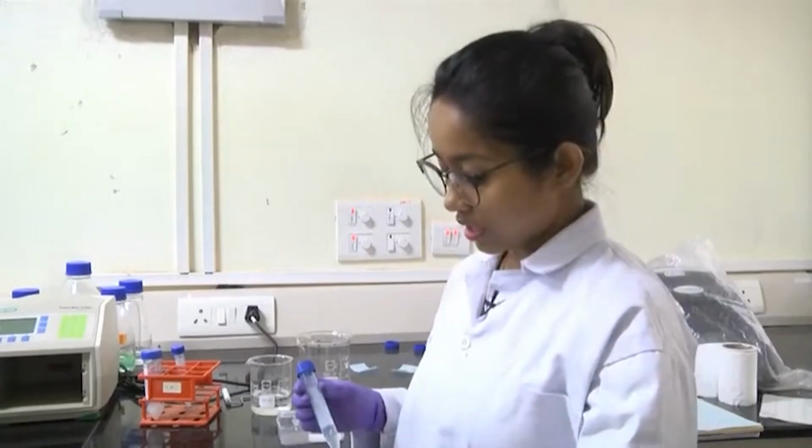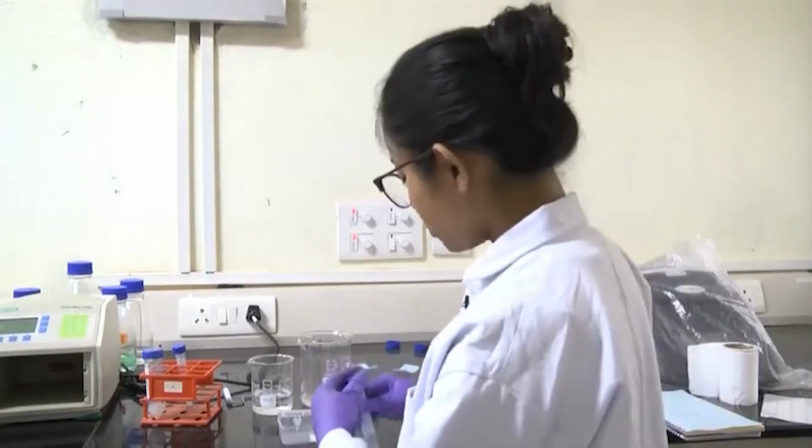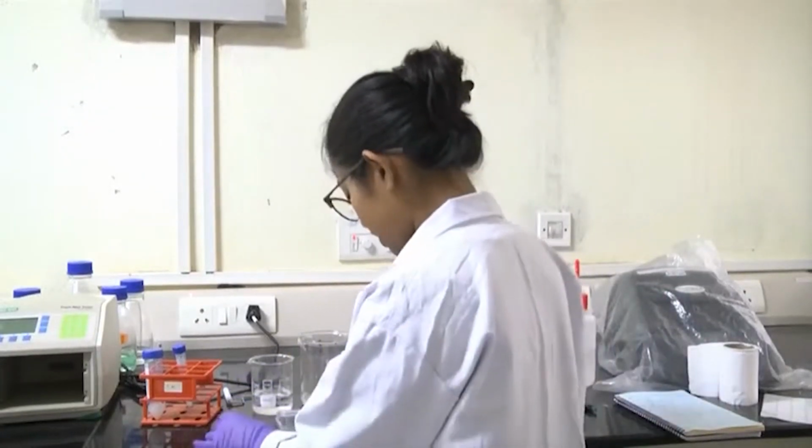So depending on your need, you have to select how much antibody you provide, and it is also a trial and error based method. You have to optimize the Western blotting technique. If you go for one concentration and do not see proper bands, then you change some parameters like the blocking, the primary antibody concentration, the secondary antibody, and like that you optimize the whole protocol. So now I will add the primary antibody here.